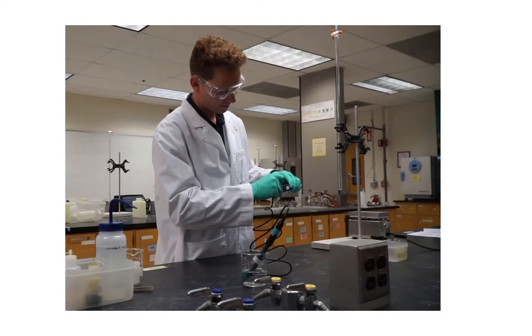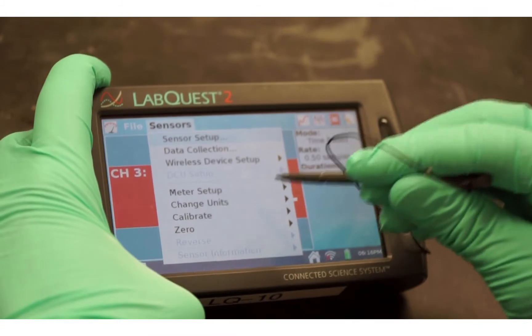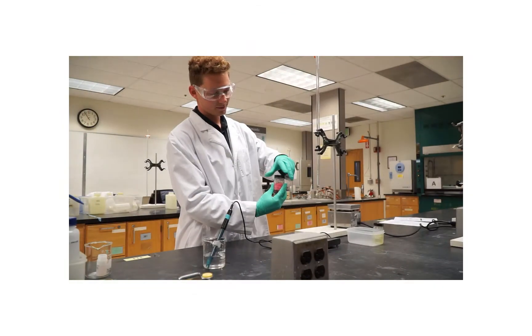Connect the sensor to the LabQuest; the sensor's pH reading will be displayed. Choose Calibrate from the Sensor menu and tap Calibrate Now.